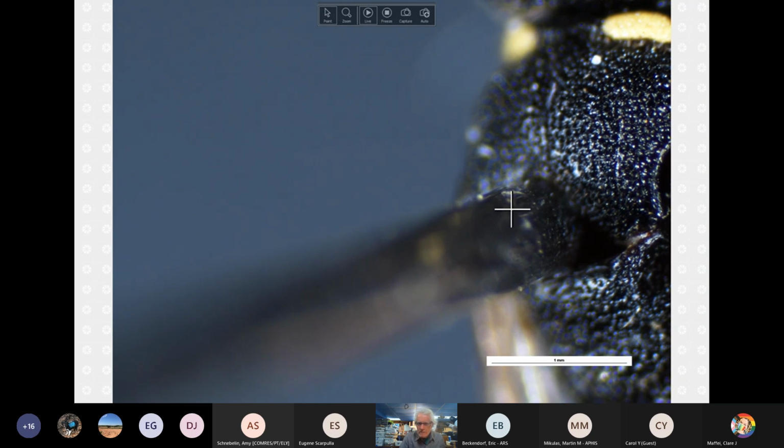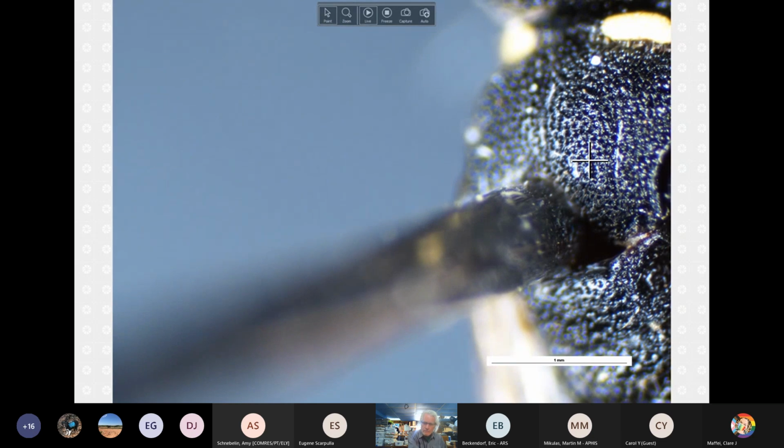So, orientation: there's the pin. Here's the parapsidal line. Here are these pits, much larger, and they all seemingly overlap. We'll take a couple of different shots of this. And the surface topography is roughened because there is topography around the pitting, so it's not completely flat.